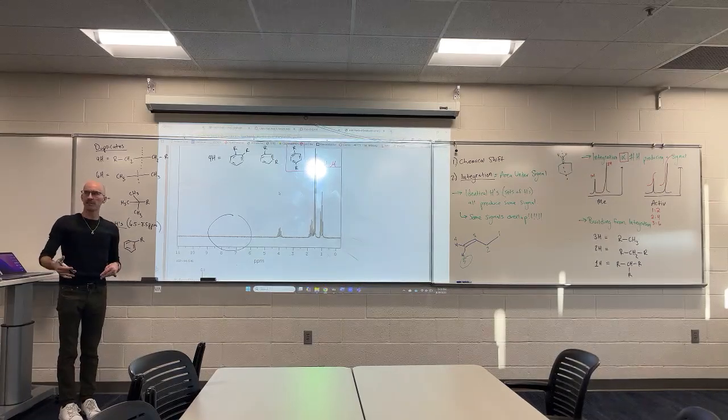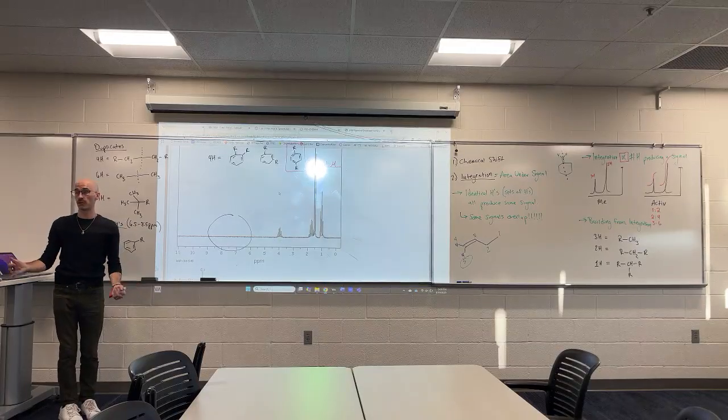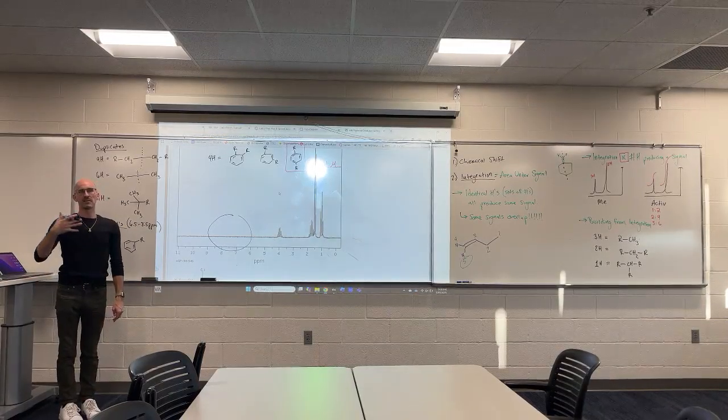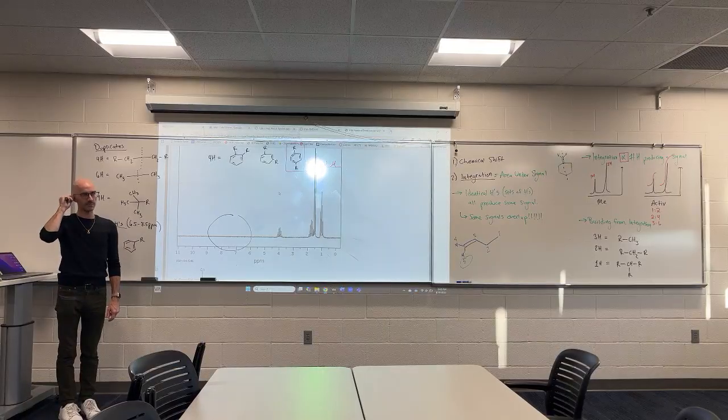Do I need to go on? 3H, there's 3 aromatic hydrogens, 3 groups coming off. 2H, 2 aromatic hydrogens, 4 groups coming off. It's less and less likely that you see tri-substituted rings and tetra-substituted rings. It's never 0, but it's just not common. Sound good?